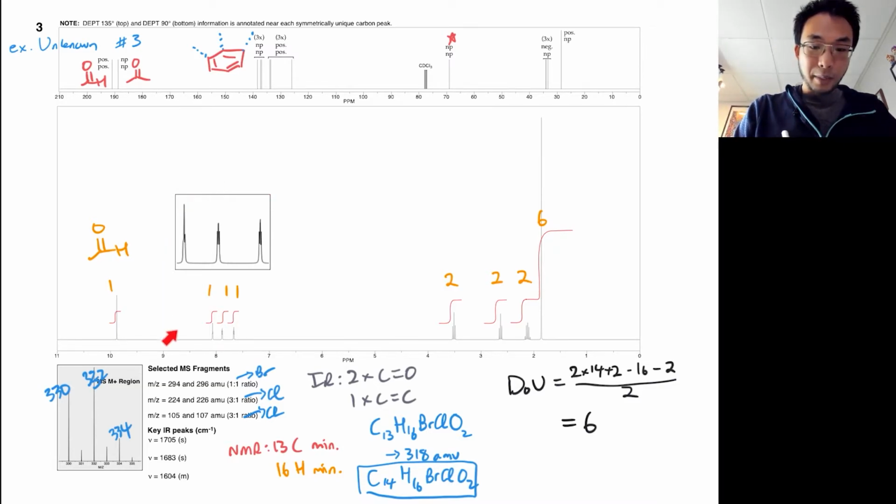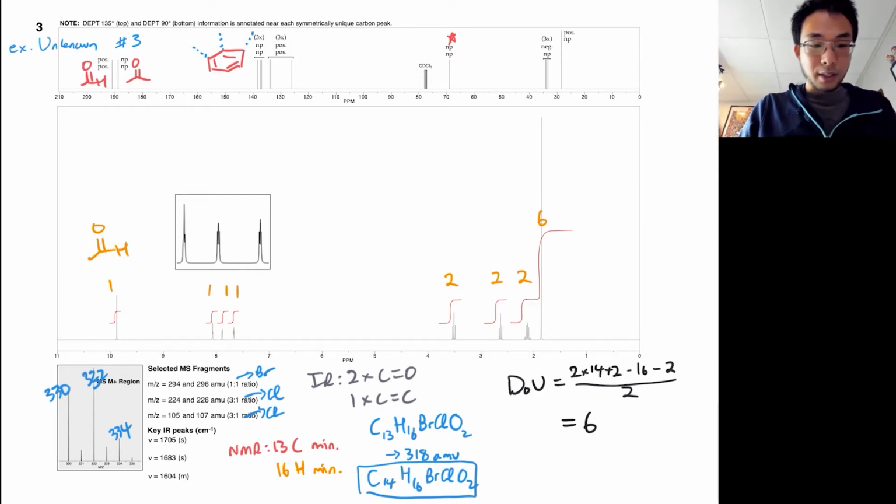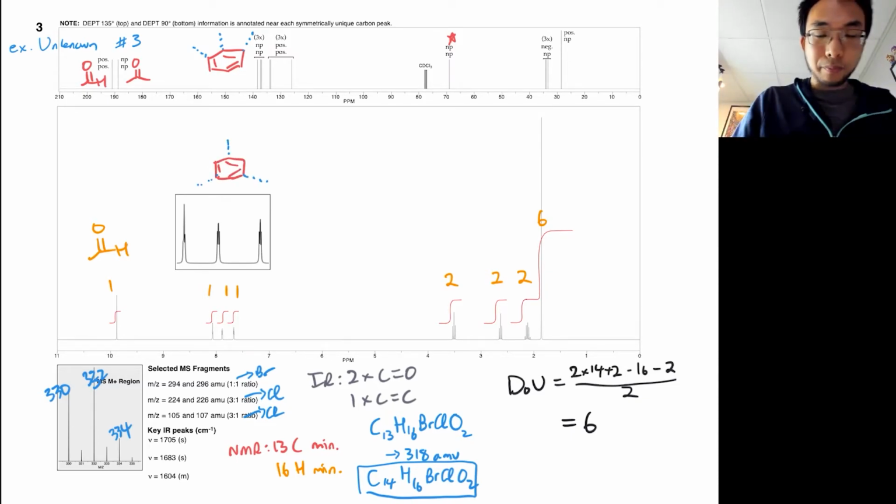So the aromatic region here, if we qualitatively look at the splitting patterns, these are much smaller J values than what you see in the upfield region. In general, the upfield region is going to have regular normal J equals about 7 Hertz. So just looking at this tells me that these are very small J values. If these are all going to give small J values, that means that none of these hydrogens have a neighbor that is a 3J coupling distance away. The only way to achieve that around a benzene ring is to put those three groups equally spaced out like this. Right?